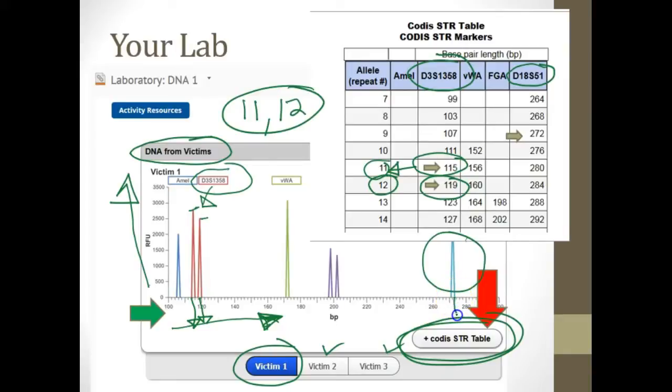You'll notice that it peaks right there, 260, 270, 272. I'm reading this along the bottom. This line right here would have been 270. It's just over that, so 272, because I know it's not 268. I know it's not 276. What's left? 272. Coming across there, that correlates with a short tandem repeat allele number of 9. It hiccups 9 times. This D18S51 short tandem repeat hiccups 9 times.